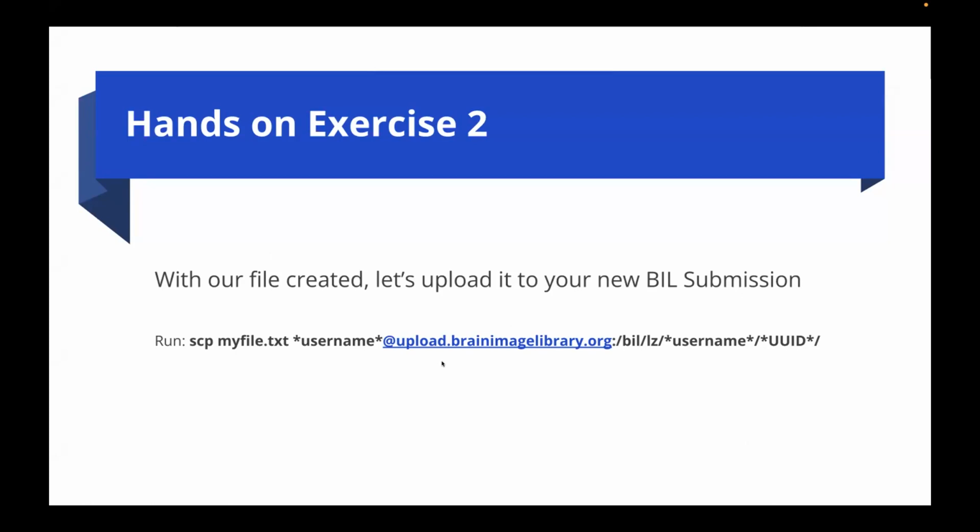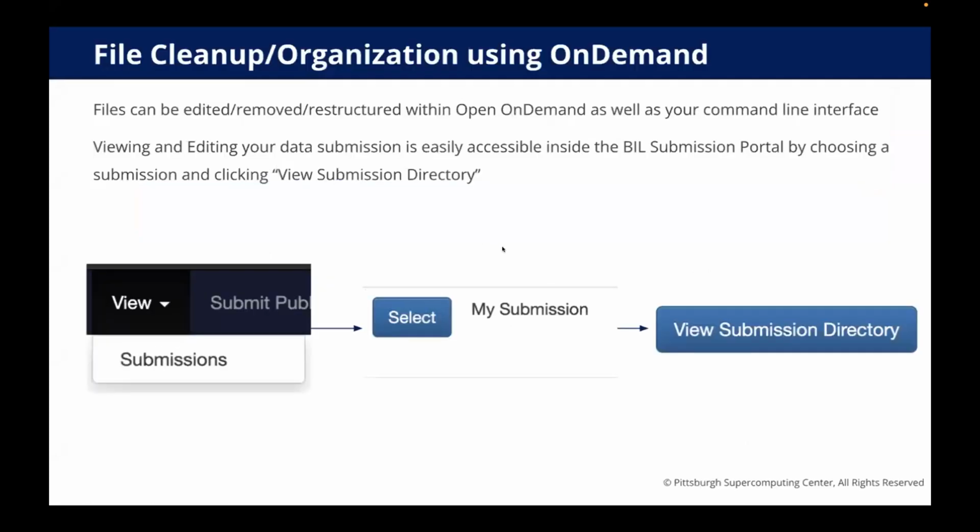Once you do an upload to BIL, there's a few different ways you can actually look at the files you uploaded. Some people prefer to do it primarily in the command line.